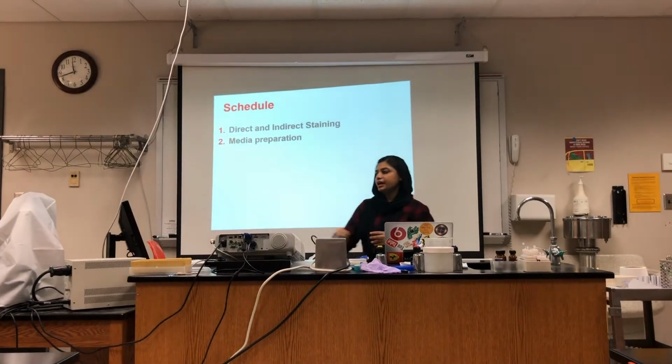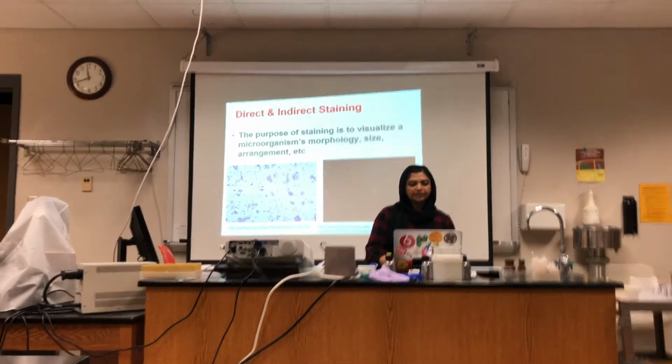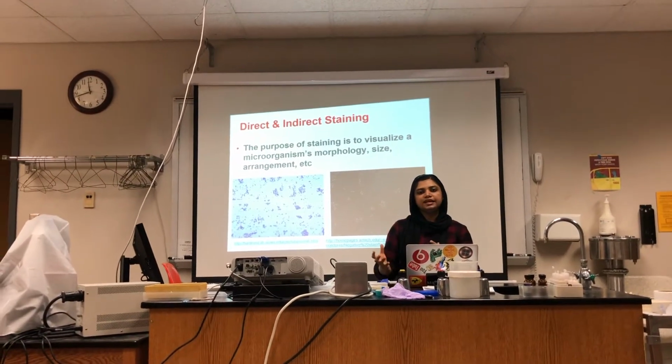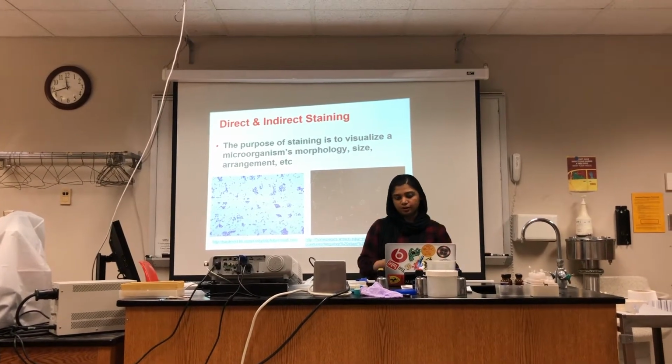Indirect staining and media preparation. So let's start with direct and indirect staining. So what do you know about staining? Staining is done mainly to visualize the bacterial cells, the structure, shape, the morphology and the arrangement of colonies.